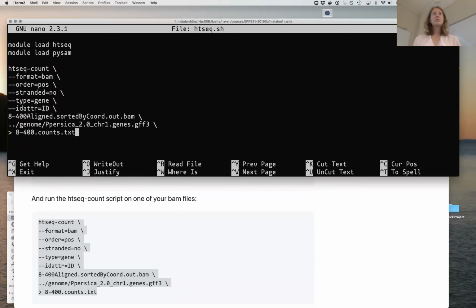Mind if I give a warning about data reproducibility in Nano? Sure. It shouldn't be an issue with this script, but with certain scripts, Nano will go up to a certain point, and then it'll stop at the $ sign to signify that there's more code after the $ sign. When you copy code directly from Nano, it's not going to copy anything past the $ sign. I ran into this issue with the undergrads in our lab when they were first starting to use Nano.